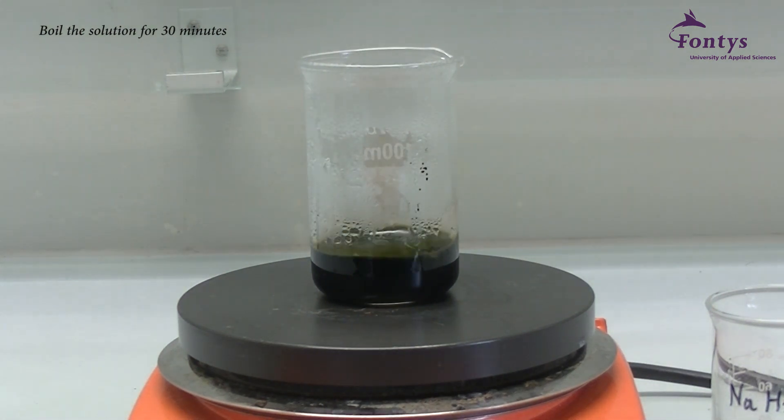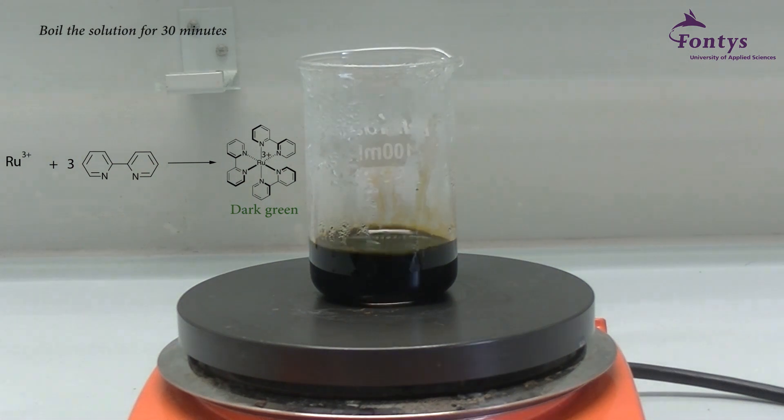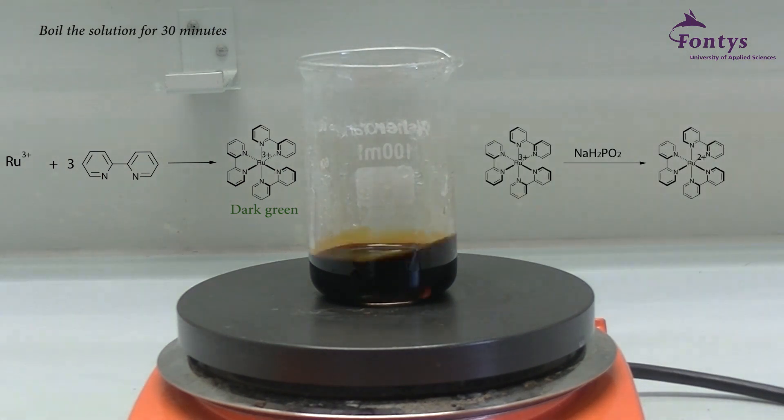When the bipyridine is added it forms a complex with the ruthenium 3+. At this point the solution turns dark green. After adding sodium hypophosphite and during boiling, the ruthenium 3+ will be reduced to ruthenium 2+. A bipyridine ruthenium 2+ complex has a dark red color. This explains the visible color change during this phase.